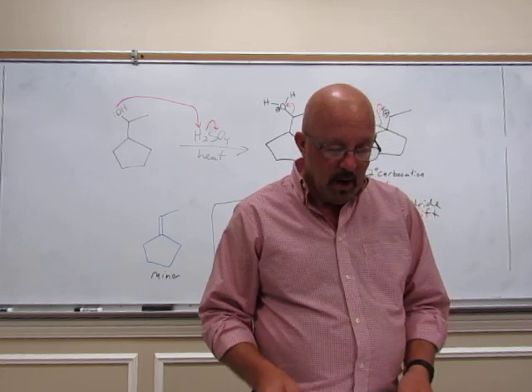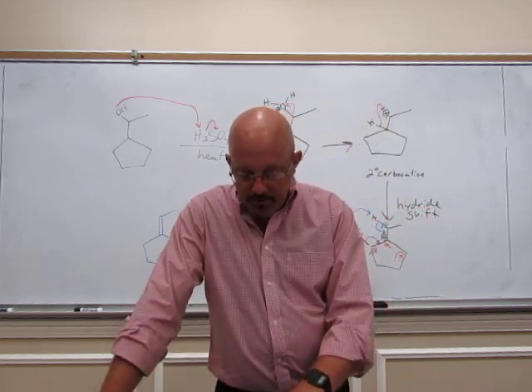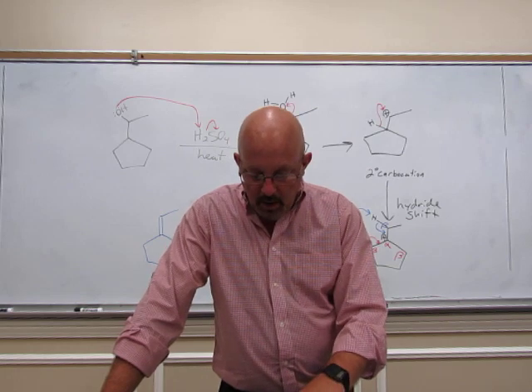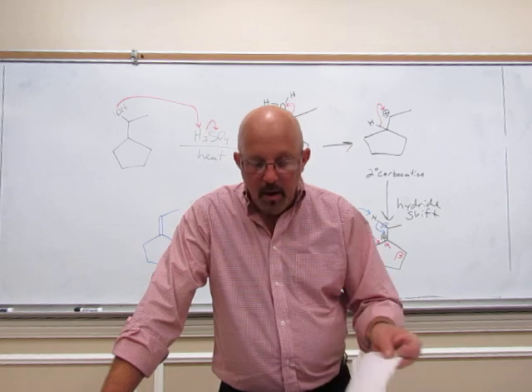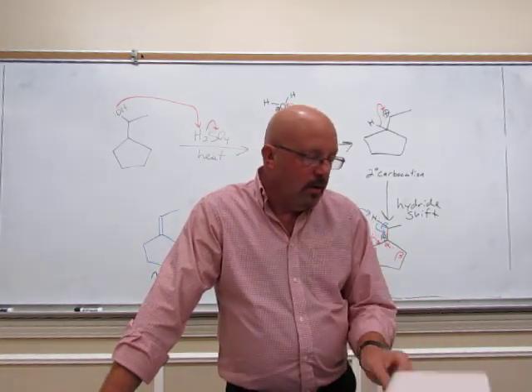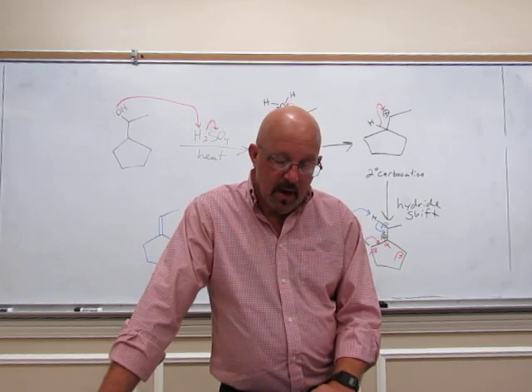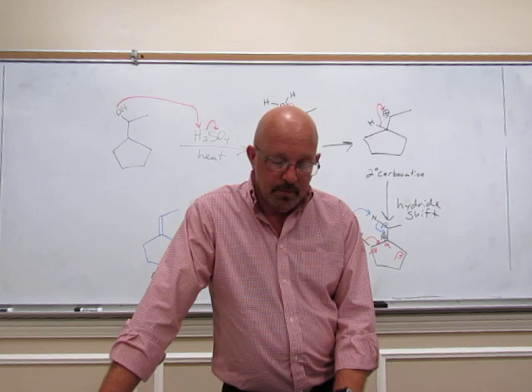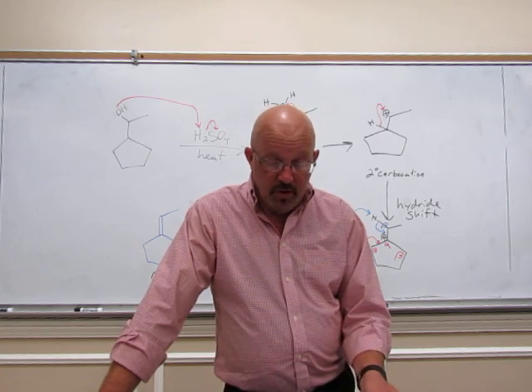Let's take a look at our procedure here. Before I forget, let me talk about the post-lab questions. We are not going to be doing GC analysis in this lab, even though it's in the procedure. Our GC is currently not working, so we are not going to run GC.